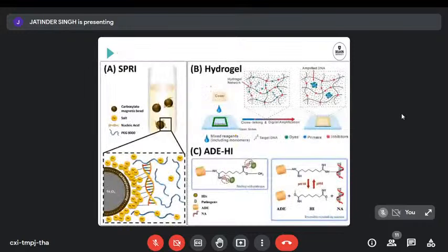The same phenomenon is underpinning the SPRI effect, solid phase reversible immobilization. SPRI is a sample preparation method that is quite often used after PCR and before sequencing to selectively isolate a DNA sequence of a certain length. Again, we've got the beads that, in presence of a salt, and quite often PEG is present as well, get a positive ionic layer formed around the beads, and the DNA sticks to that.